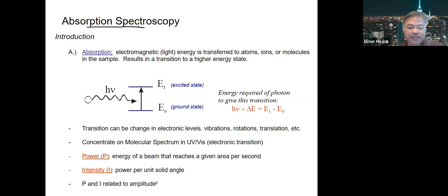spectroscopy. We could say absorption spectroscopy is the single most common method for quantitative analysis of molecules. After the balance and the pH meter, the next thing that the lab must have is the so-called Spectronic 20. Spectronic 20 is the simplest spectrophotometer that is being utilized and still exists until now.